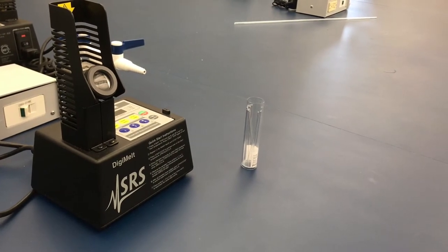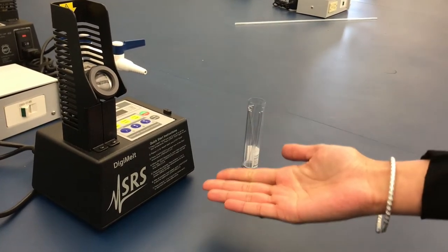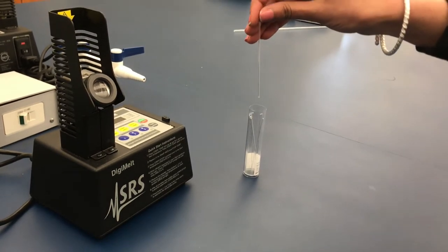In order to find the melting range of a solid, a DigiMelt and melting point tubes which are closed on only one end are required.